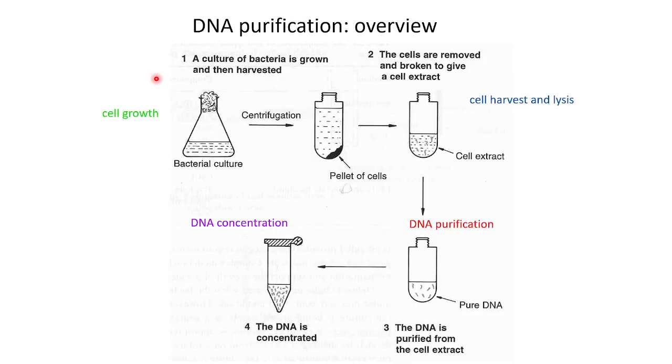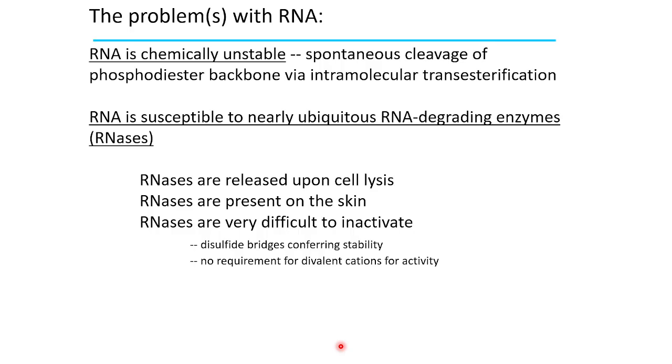But why do we need to do PCR? For the amplification and different recombinant studies, like cloning, site-directed mutagenesis, addition and deletion of different genes, or playing around with the particular DNA that you have extracted. So this is the DNA that you have extracted. Now you can play around with it.